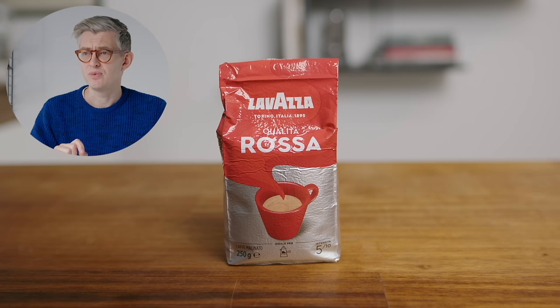It just doesn't have that much caffeine compared to good fresh coffee. As a side note, we measured a V60 brewed with Lavazza — which has some Robusta in it, but it's still fresh coffee. The caffeine concentration there was over 100 milligrams per deciliter. So cheaper raw materials and some Robusta will have more caffeine, meaning specialty coffee has less caffeine than cheaper fresh coffee — but it's still more than instant.